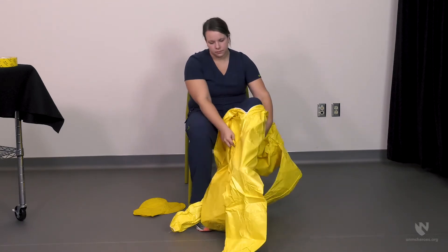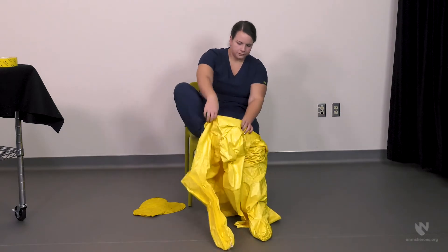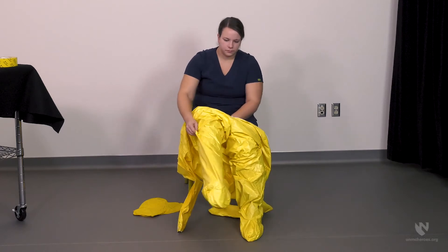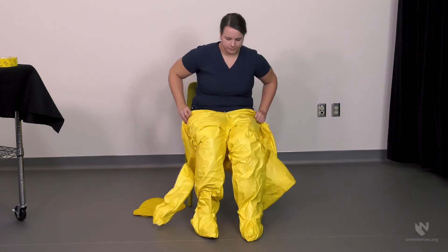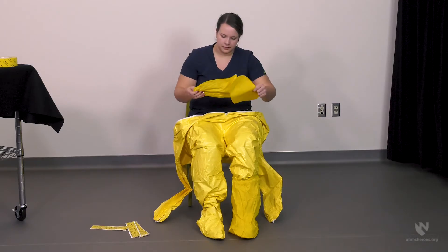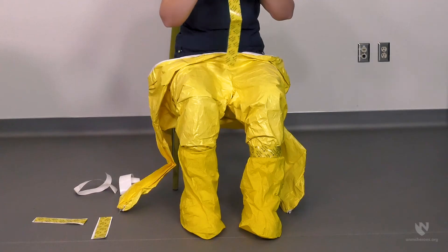Next, step into the suit and pull up to waist level. Once the suit is at waist level, apply the outer boots. The outer boots should then be taped along the upper rim, sealing the boot to the suit.